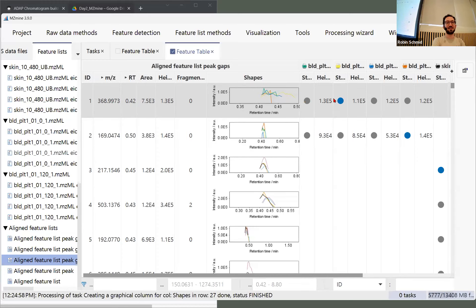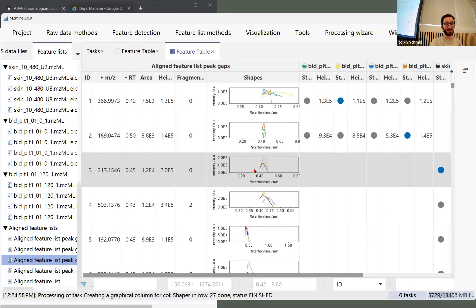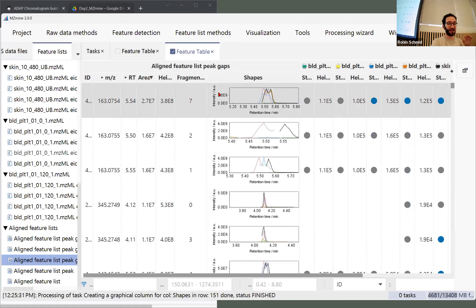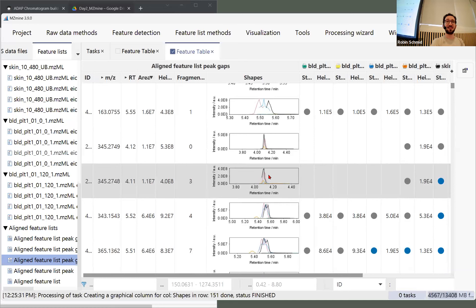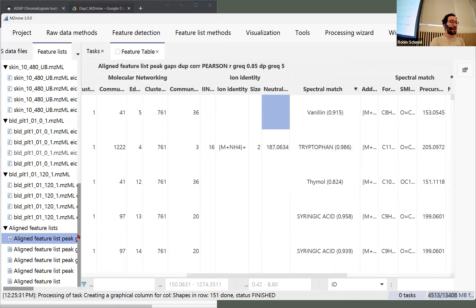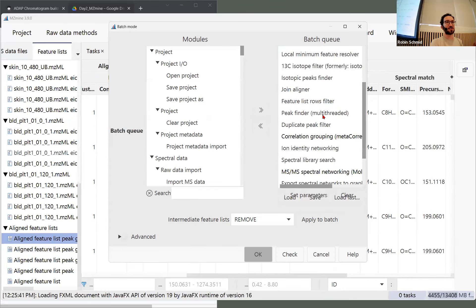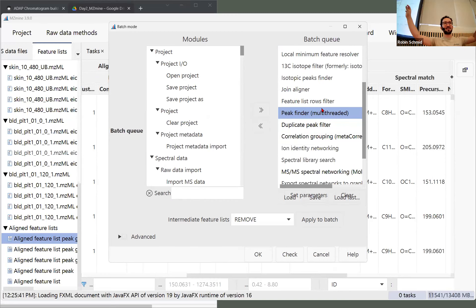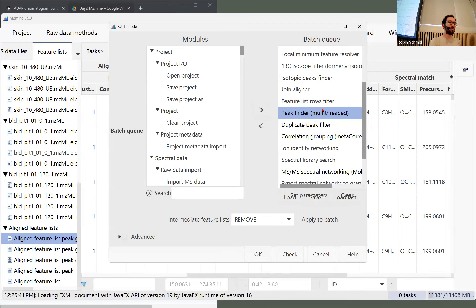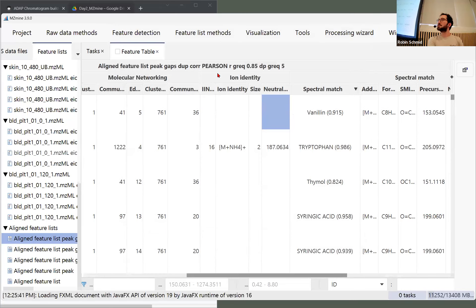If you open the gap-filled feature list, it might look more filled. You can add a 'feature state' column: blue means aligned — the initial feature that made this row — and gray means gap filled. For weird-shaped features, there's at least some intensity, and you may see very large peaks that were missing before. The duplicate peak filter then comes into play: after gap filling, the average m/z and retention time may converge for two duplicates — the duplicate filter removes that row. Then there's correlation grouping, which we'll look at in the network visualizer.